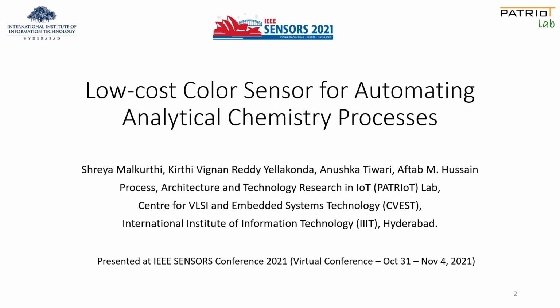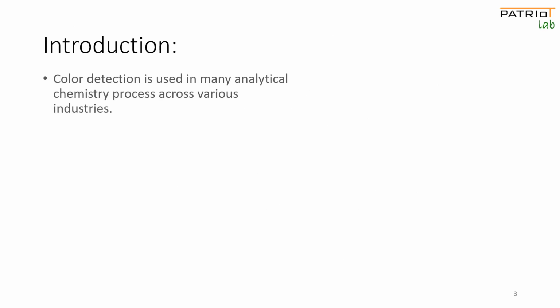The topic for my paper presentation is low-cost color sensor for automating analytical chemistry processes. In this study, we have developed a low-cost electronic system to detect the color of a liquid sample in the RGB color space and compared it with a camera-based system.